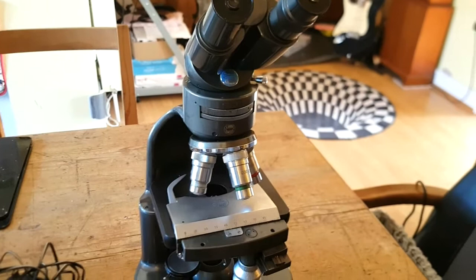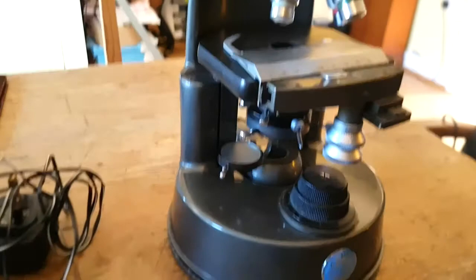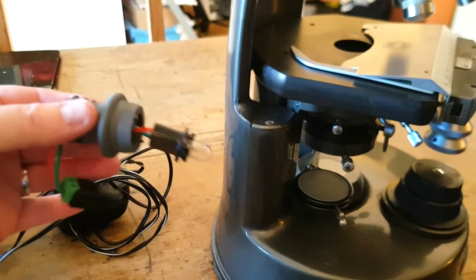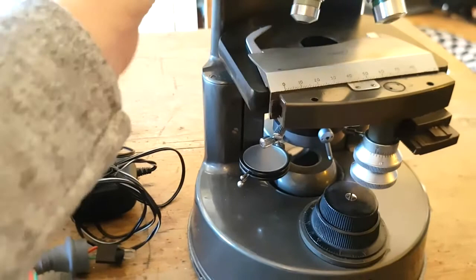I just wanted to quickly show you the microscope that I used for the photographs in this video. It's an old Seabaker London histology microscope, it's very, very old. For a light source we've got a homemade kind of car headlight bulb light source that fits in the back. That won't illuminate anything from above like a big fly or a wasp or whatever, so I just use a clip-on reading light. I kind of clip that onto there and just angle the head down and point it wherever I need it to be pointed.